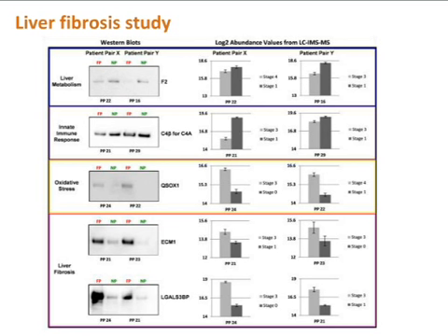In order to verify these proteins that we found, we wanted to look at the 4 different groups, and we looked at 5 specific proteins, and we did Western blots on them, and then compared those to the abundances we observed in the ion mobility studies. And our analyses of these compared very well to each other, so that made us feel more confident in the proteins that we were detecting as statistically significant.